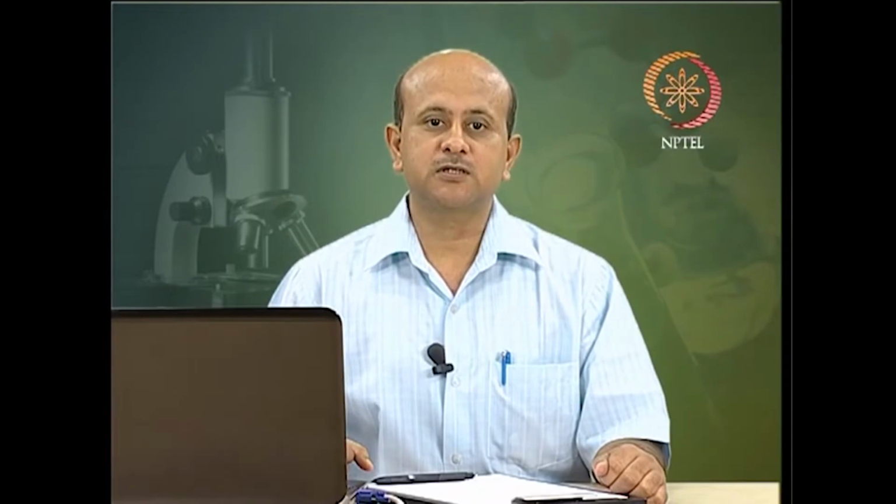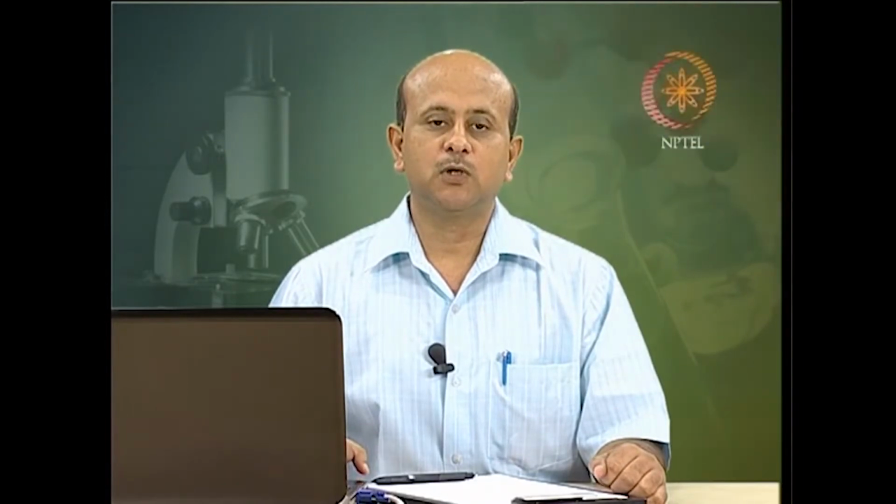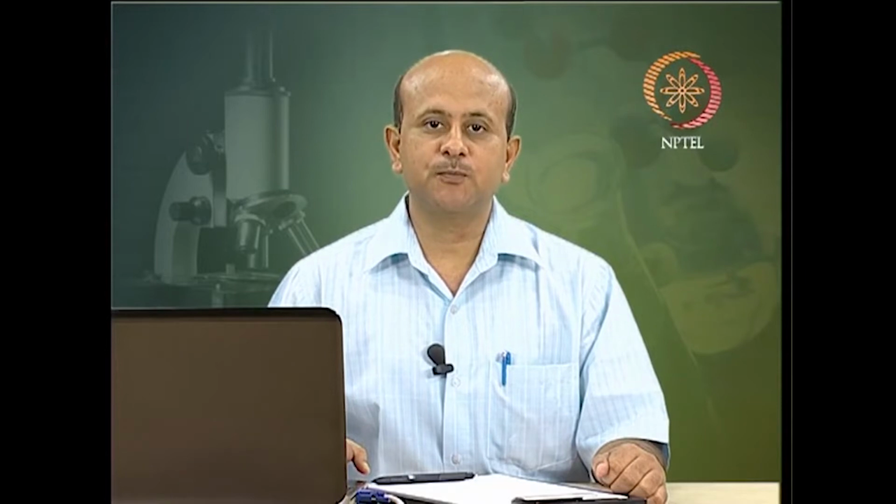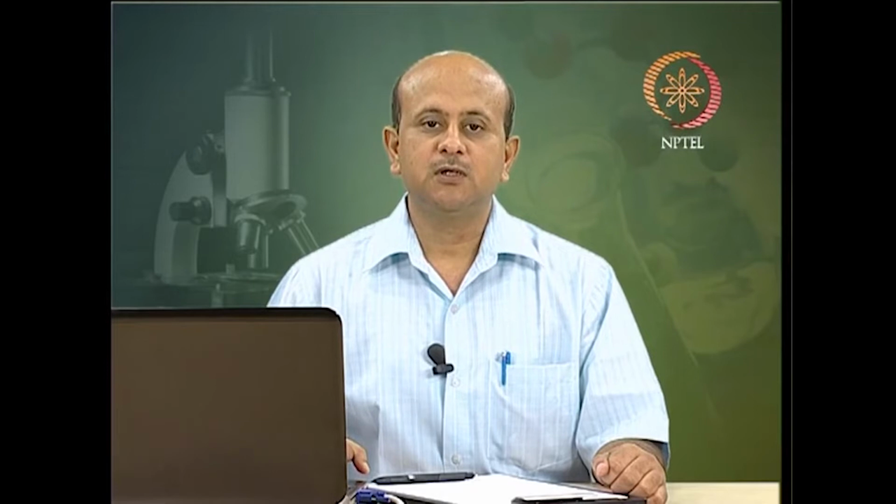In this lecture, we are going to discuss two techniques. One is infrared spectroscopy and the next one is fluorescence spectroscopy. Now, infrared spectroscopy is an example of absorption spectroscopy, whereas fluorescence spectroscopy is an example of emission spectroscopy.